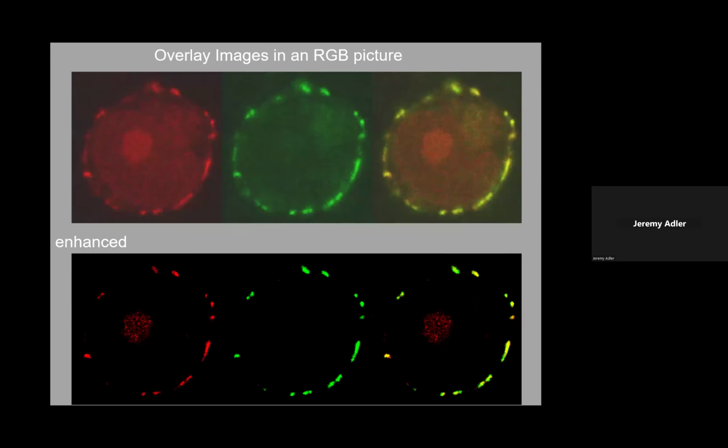And of course, it's very easily photoshopped, as we've demonstrated, and we'll demonstrate again here. Red, green overlaid. If I mess around with the offsets, I can hide the fact that there is considerable presence of each fluorophore within the cell.